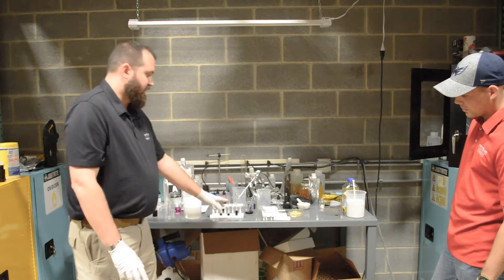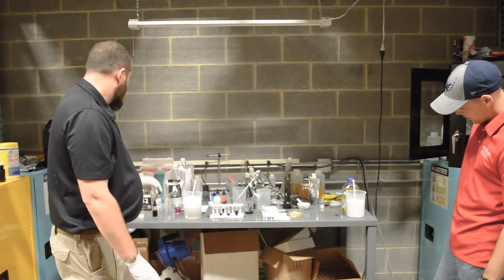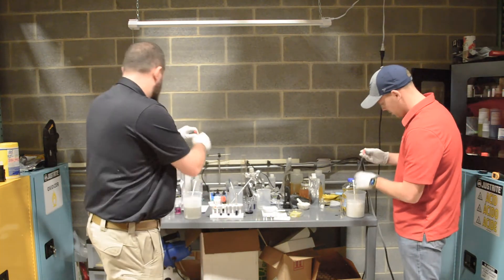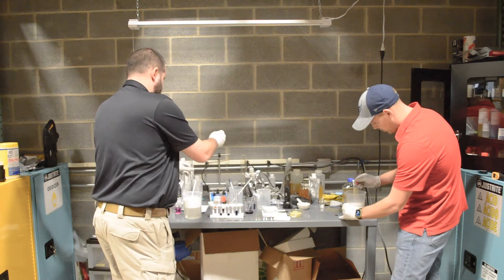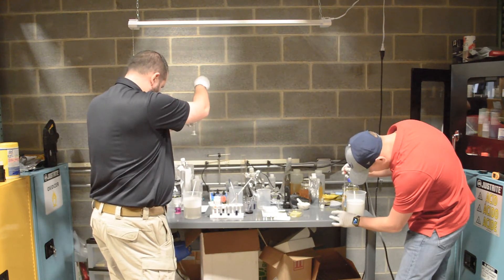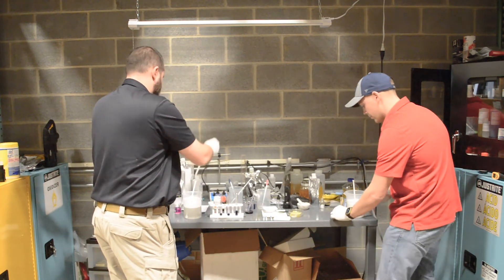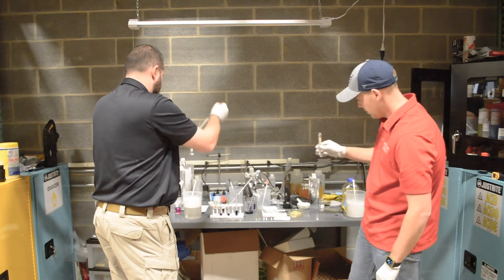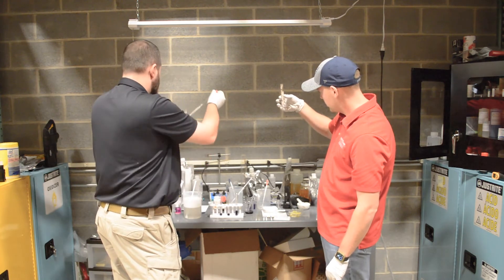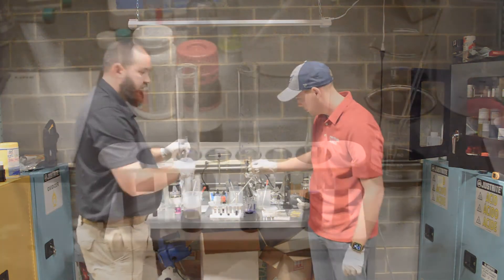The one on the far right that's just undisturbed — that'll be our control solution — and that'll allow you to see the difference in the color change. So we got two milliliters in both.